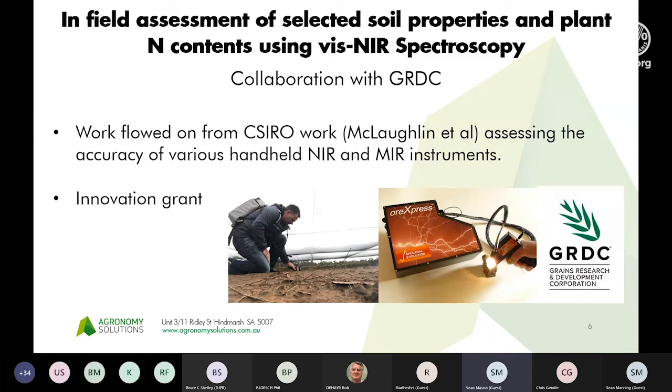So it was touched on previously, NIR has become quite cheap. There are instruments out there for only $1,000 or $2,000, but their actual performance matches their cost at the moment, with reduced wavelengths et cetera. So that was the outcome of that project.